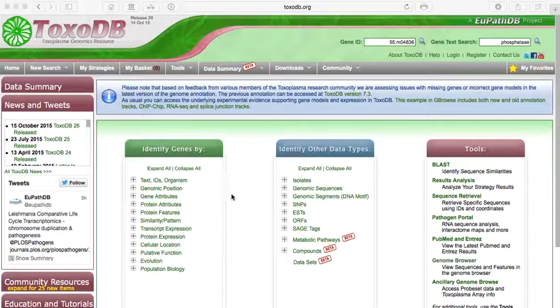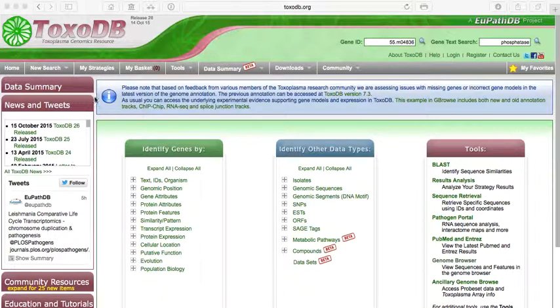In the case of ToxoDB, it contains many different genomes from different organisms. They're all organisms that cause diseases in humans and in animals. It gets its name from the organism Toxoplasma gondii, which can cause disease in humans and animals alike.